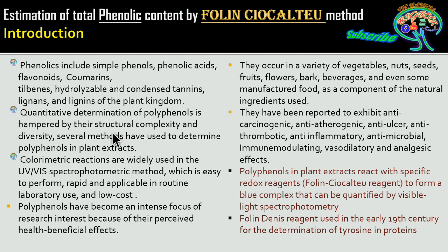So there is no single confirmed method to study polyphenols. The FCR method that we are studying is one of the methods out of all these, and the procedure we have selected is one out of a bunch of procedures.